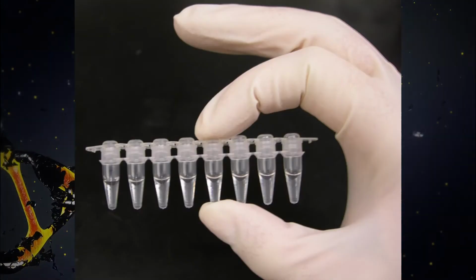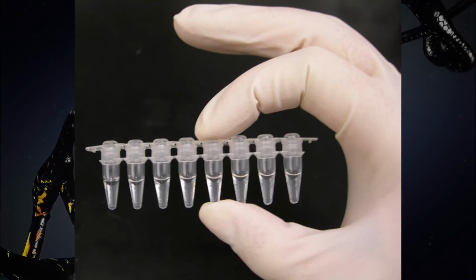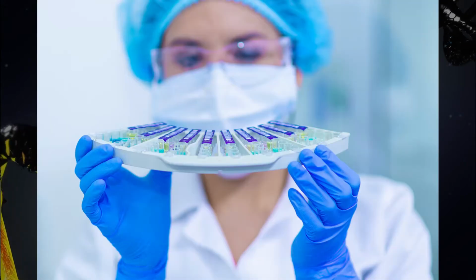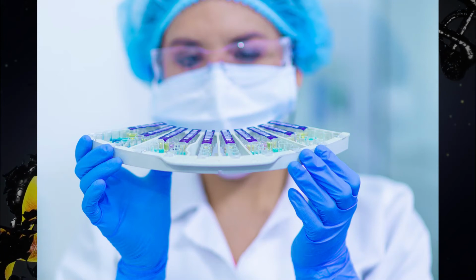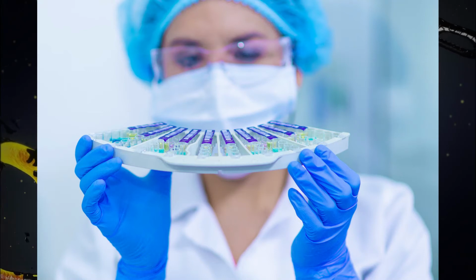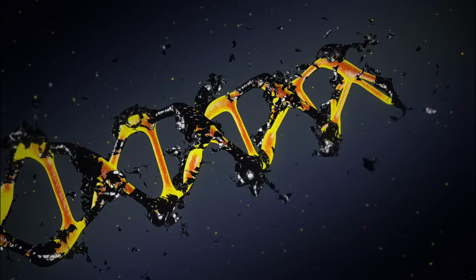With this basic background information given so far, you have most of the common information to PCR as a whole, but there are many different kinds with strengths and weaknesses. The ones we'll cover in this video are real-time PCR, which is quantitative PCR or qPCR, Reverse-Transcriptase PCR, Multiplex PCR, nested PCR, high-fidelity PCR, fast PCR, hot start PCR, GC-Rich PCR, long-range PCR, and arbitrary primed PCR.